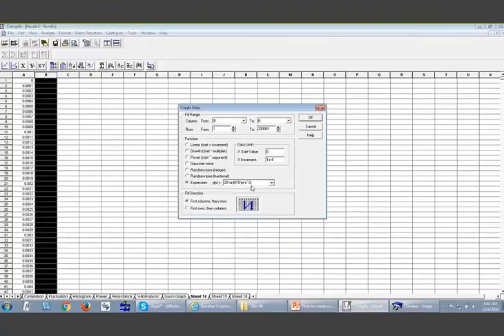If I put 20 here, that means 20 millivolt, you can put the magnitude, 20 millivolt, and then sine with 10 times pi times x. That is basically the expression. Let's do this one first. I don't use 20, just use this one to make it easy. Now I hit OK.